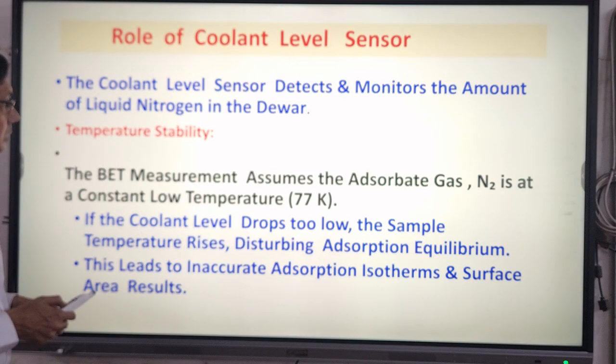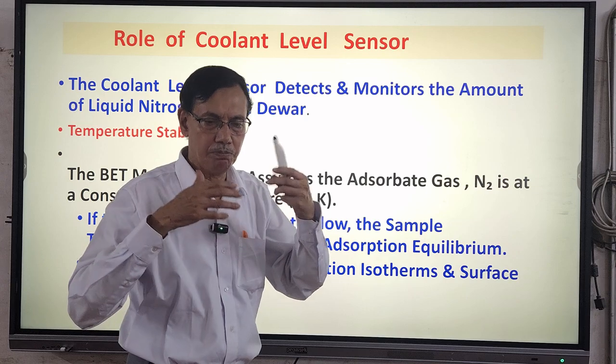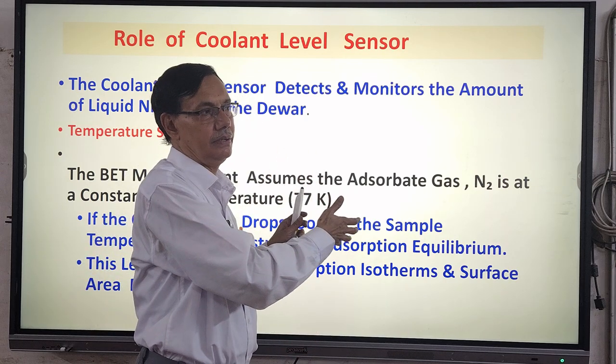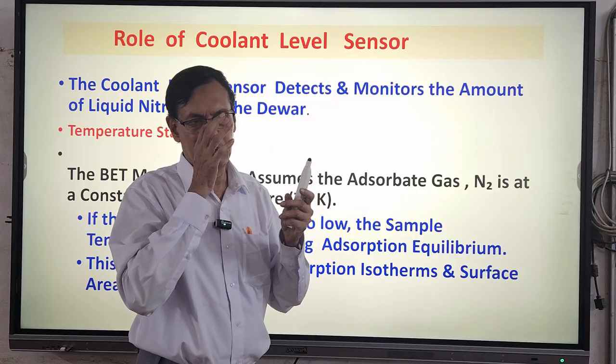So now again let me summarize, and we'll just proceed to the DST PURSE lab. When we perform this experiment, you will understand each and everything. So this is very short information. Again I must summarize that there are two parts.